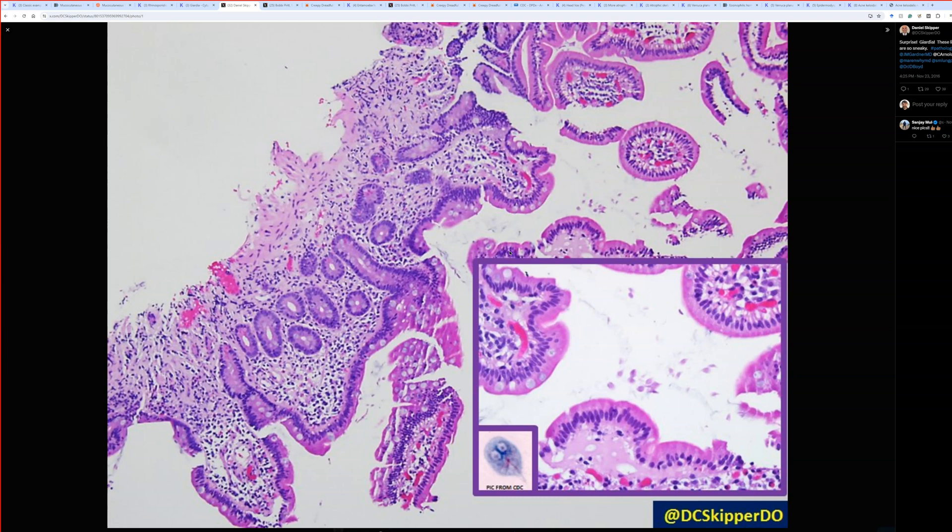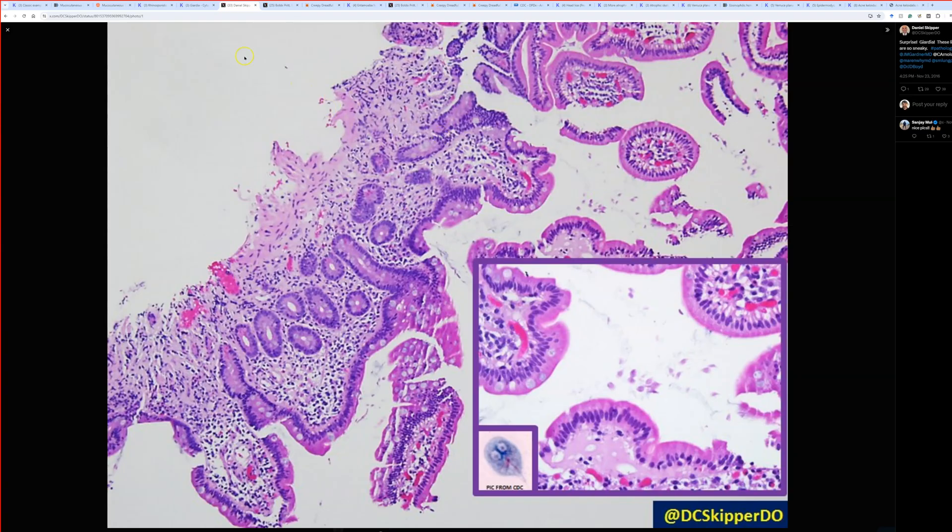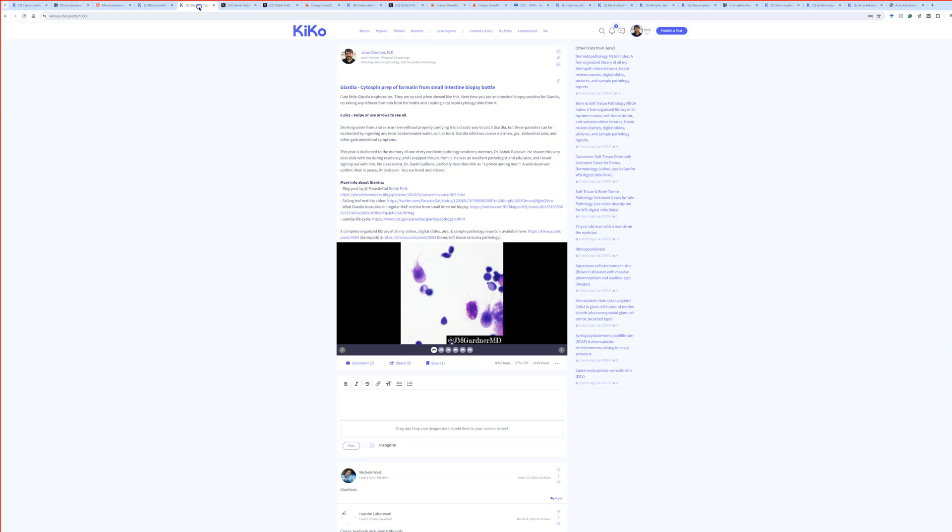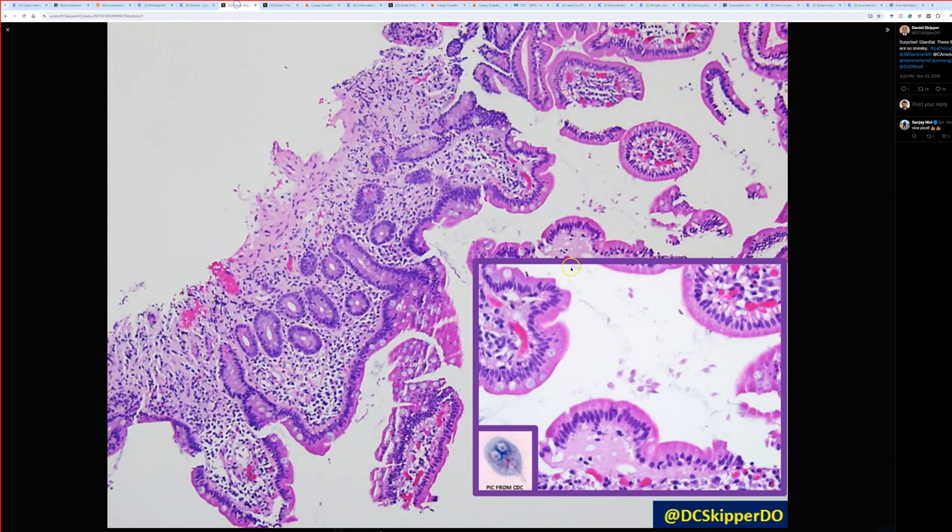And that's the closer view. So you know, that's what I think we're used to seeing in pathology on a regular H&E. But a cytospin gives us this kind of image that's down here from the CDC, the flat view of the trophozoite, where you can see the two little, they look like little eyeballs, right? The two little nuclei or whatever they are. So that's a pretty cool trick to get a nice, pretty slide for teaching, if nothing else.